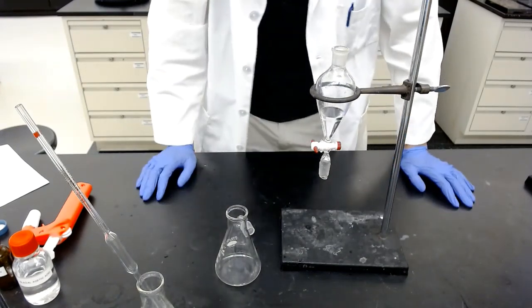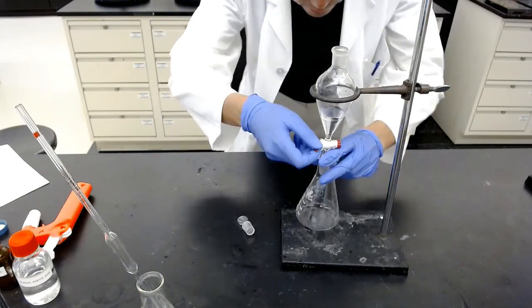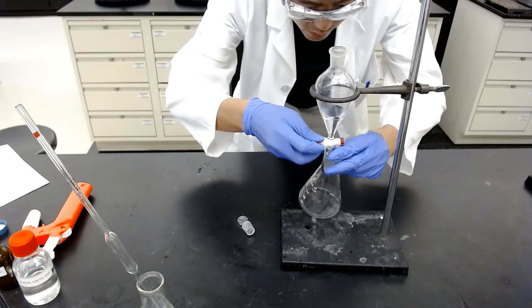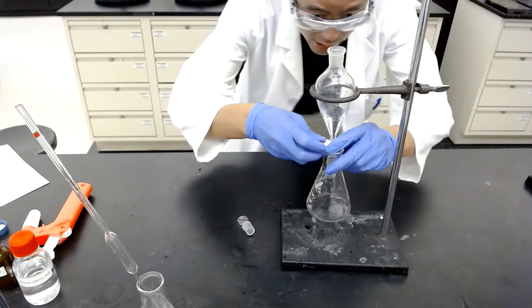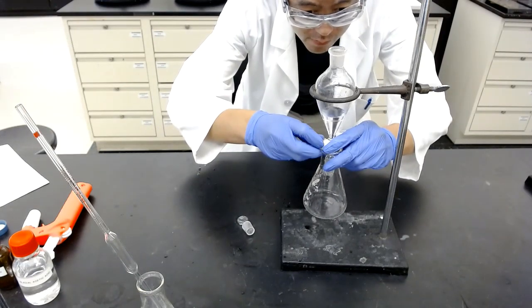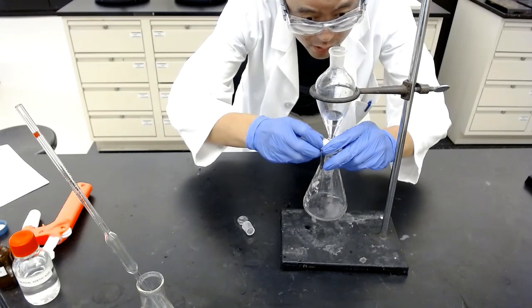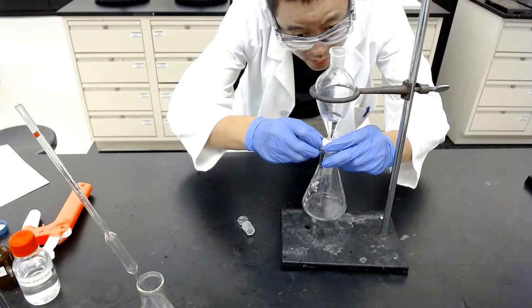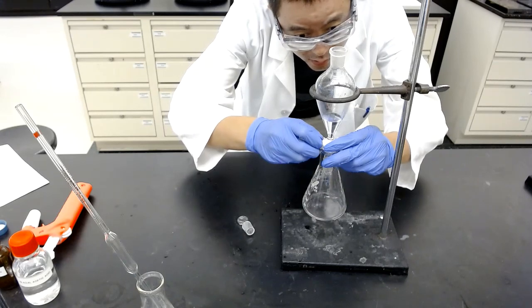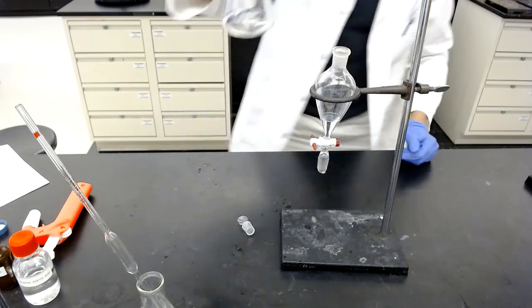And we need to collect the bottom aqueous layer, of course. So, here we go. You just open up the valve. Just collecting the bottom aqueous layer. Go. All right, just drain the bottom aqueous layer out. When it starts to reach the interface, yeah, slow down, right? There we go. Okay. Yeah, this is the aqueous layer.